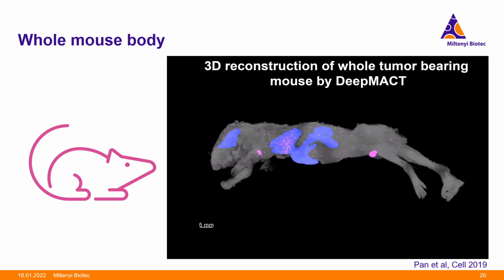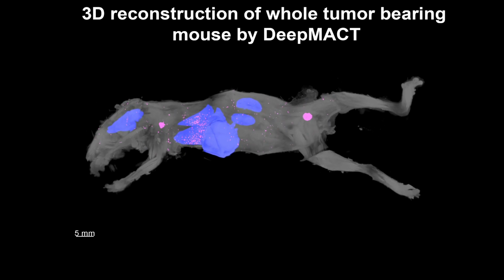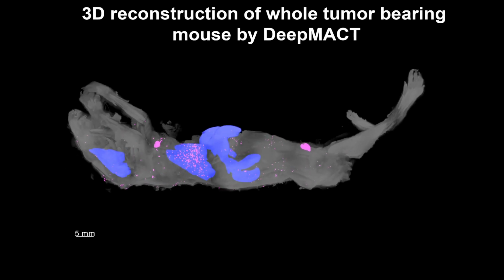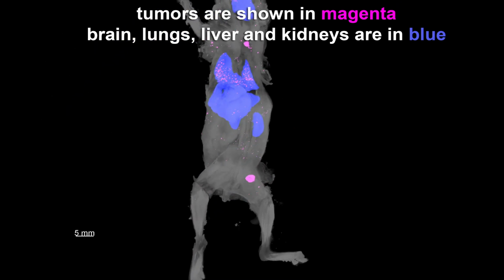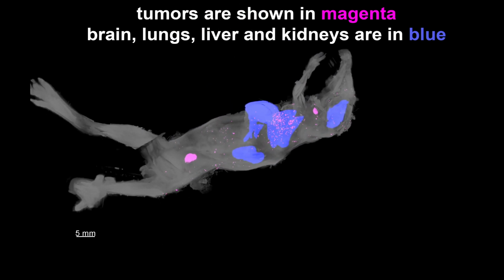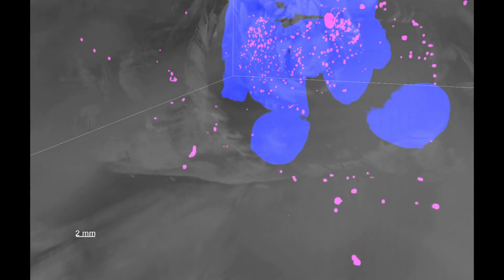It is also possible to move up to imaging a whole mouse. Yes, a whole adult mouse can be cleared and mounted into the ultramicroscope Blaze. This is actually one of my favorite examples of the power of light sheet microscopy to understand the tumor environment. In this example, researchers were looking for a reliable detection of disseminated tumor cells and of the biodistribution of tumor-targeting therapeutic antibodies within the entire body of this mouse. This would allow them to better understand and then hopefully treat cancer metastasis.